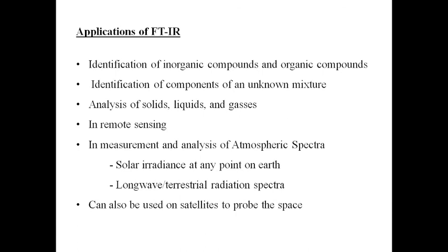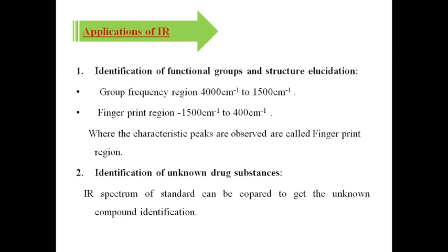Used for checking on the probe of the spaces. Application of the IR, as I told earlier, is usually for measuring the functional groups for structure elucidation. So group frequency is from 4000 to 1500 centimeter inverse, and the fingerprint region is 1500 to 400 centimeter inverse, where the characteristic peaks of the functional groups are also seen in this region. That's why it is called the fingerprint region.